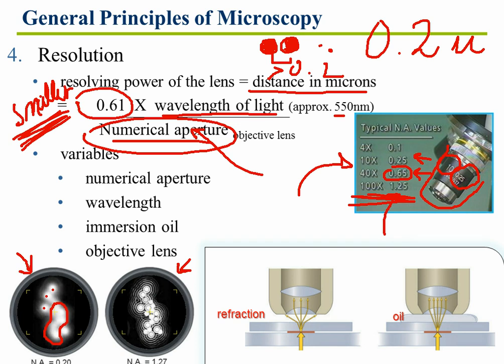If the resolving power was bigger on the microscope, like 0.5, in other words, it's not as small. And remember, the distance between these two objects is 0.2, but the lowest resolving power on the scope that you're using is 0.5, they will look like one blurred object. You will not be able to identify them as two. So you can see why the small value is what you want.